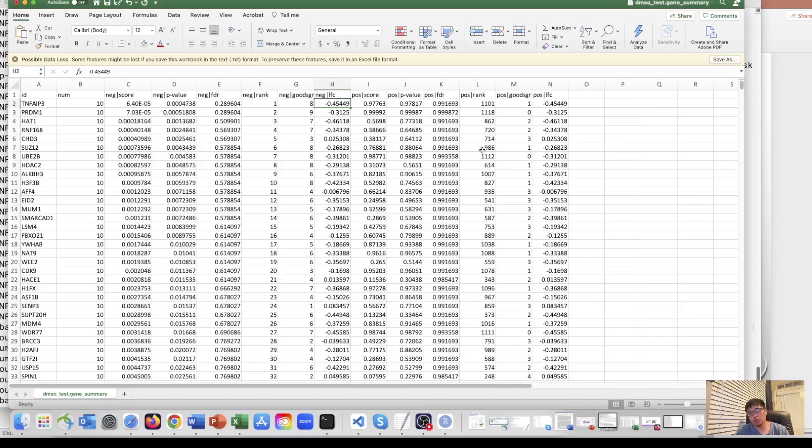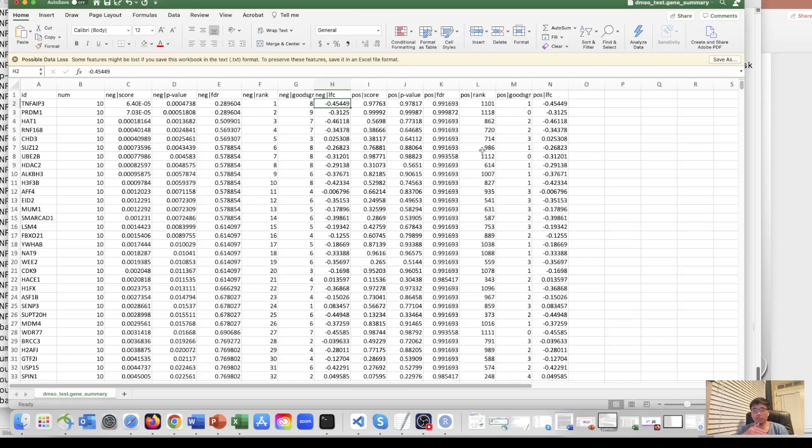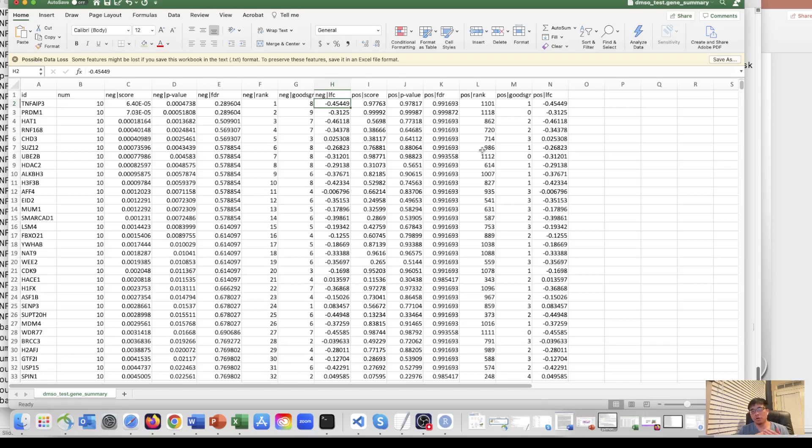And with this, you can also do the GO analysis to see which pathway is enriched. So there are many other following analysis. But I will not include it in this video because I will separate into another video to see how we can do for the following analysis. But with today's video, you will be able to get some preliminary results with your CRISPR high throughput screen data.